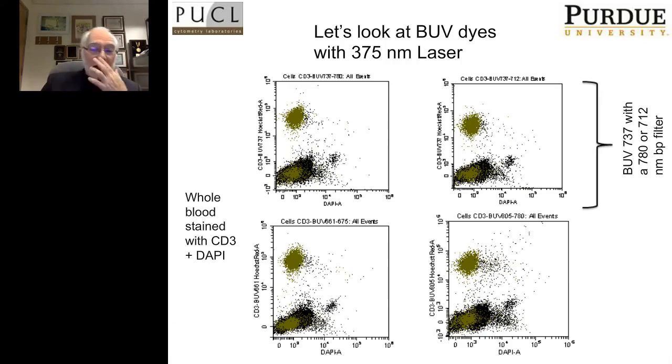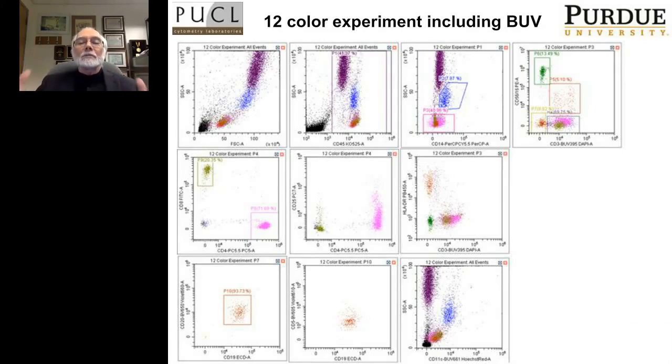I think it's a few slides down, but just to show you a couple of slides that it is indeed possible, depending on the laser combination and the WDM modules that you establish, that you can produce excellent quality multicolor data analysis. And this is showing some 12 color analysis using the true UV laser.